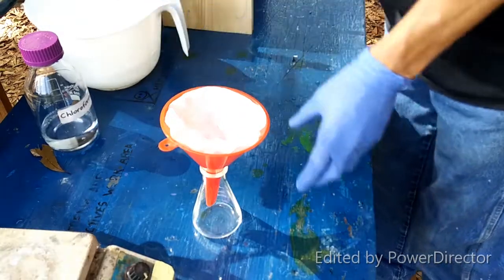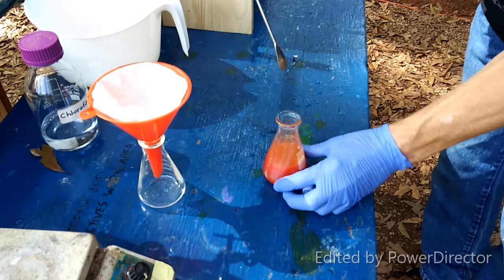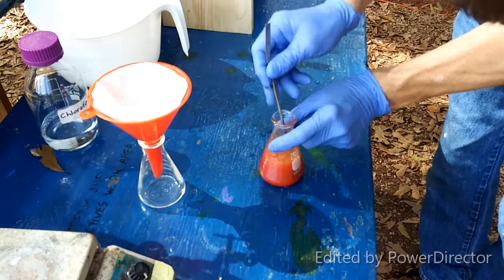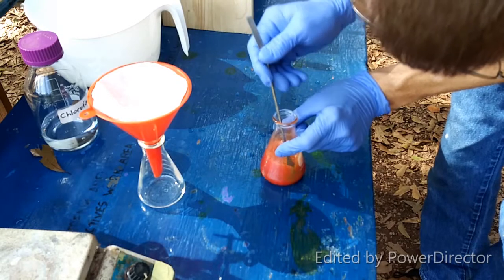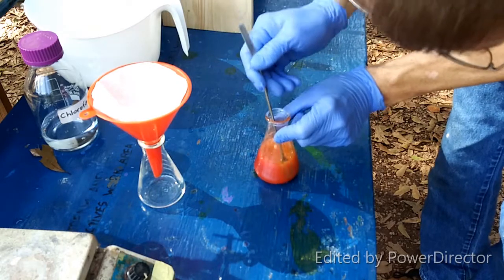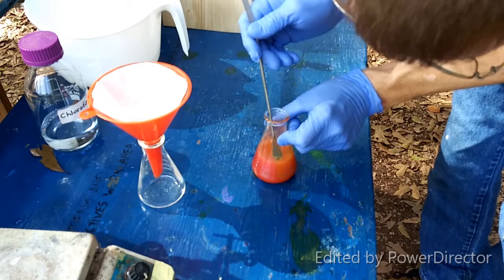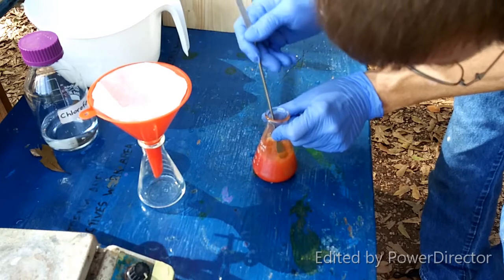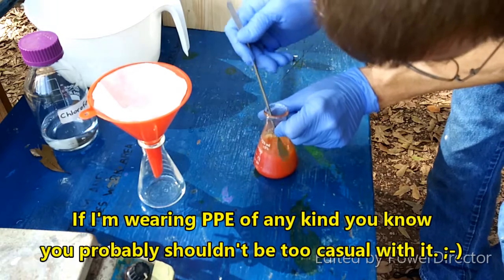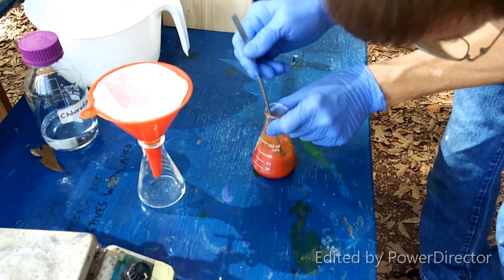Let's do this. Okay. Hello, turn it the right way. There we go. I'd really like to not splash any of this on me. That would probably be a bad thing. Antimony trihalides are pretty poisonous.